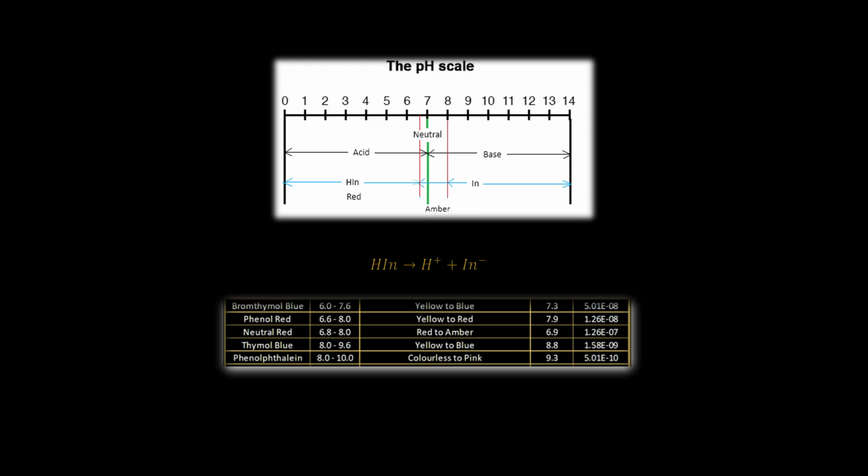It is the equilibrium point where the forward and reverse reactions take place. One additional molecule added shifts the reaction further to the right, neutralizing the indicator, which in turn changes color. The endpoint is defined by the indicator that is chosen. It depends on the speed at which the color change occurs. It could be fast or it could be slow. Hence, the titrant is added slowly to compensate for the slower reaction.